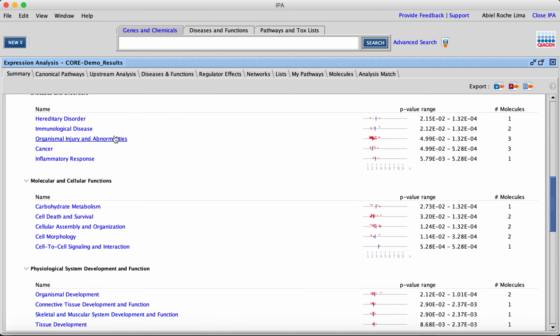Diseases, this is something very used, very implemented, very well studied. Most of the bioinformatics analysis associated with data sets that we work in collaboration with other investigators are related with diseases or pathways associated with a group of proteins under the study. And most of them appear in here that are also at the top.